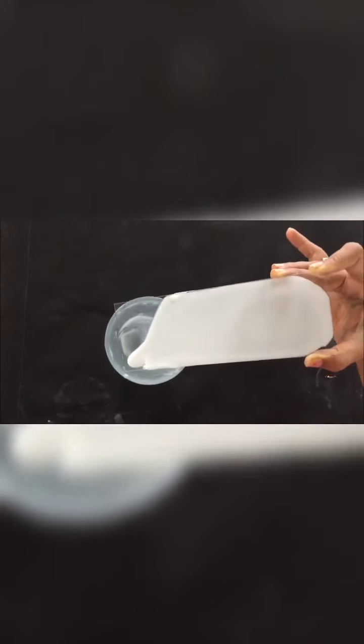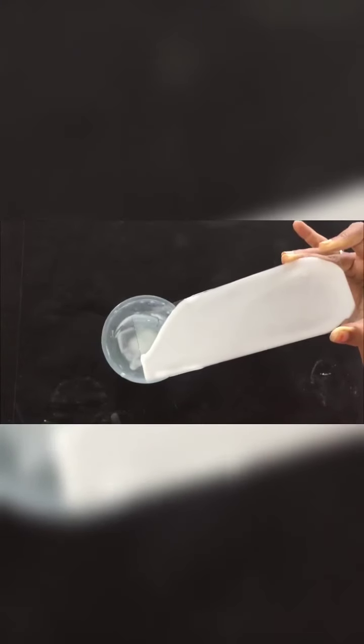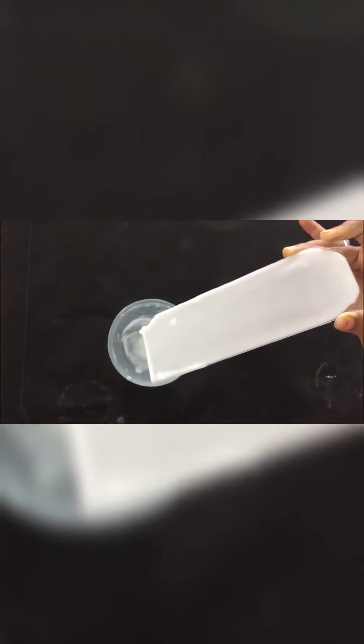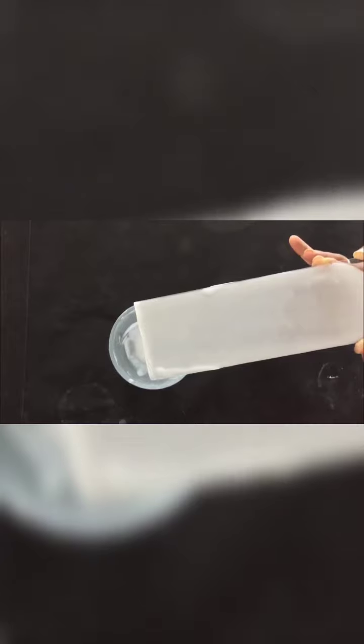Move the glass plate so that the slurry gets uniformly coated over the glass plate. You can see that the slurry is uniformly coated over the glass plate. After uniformly coating the slurry, then dry these plates at room temperature.